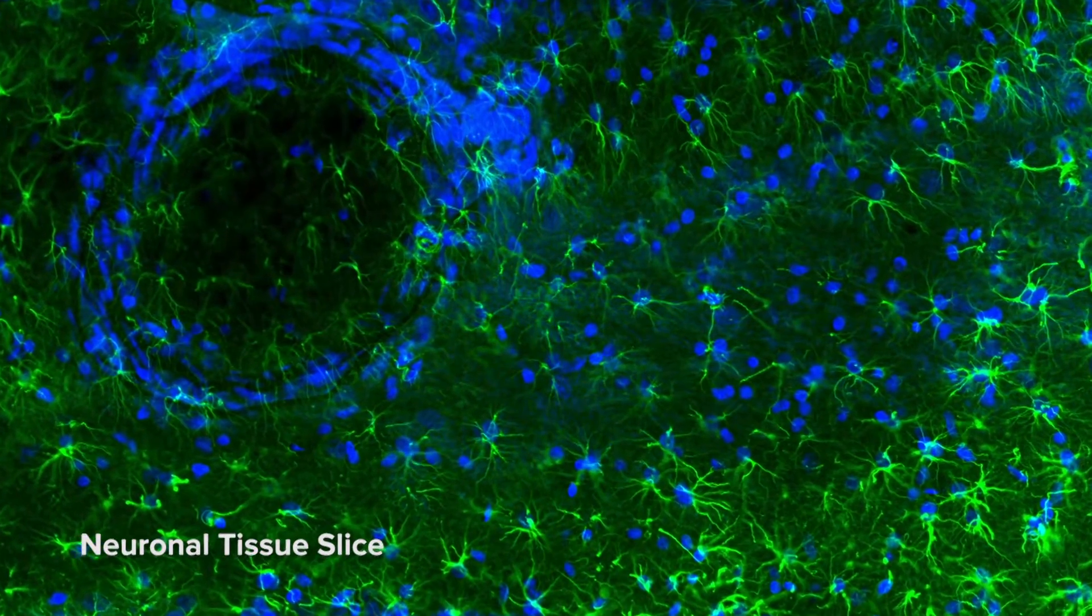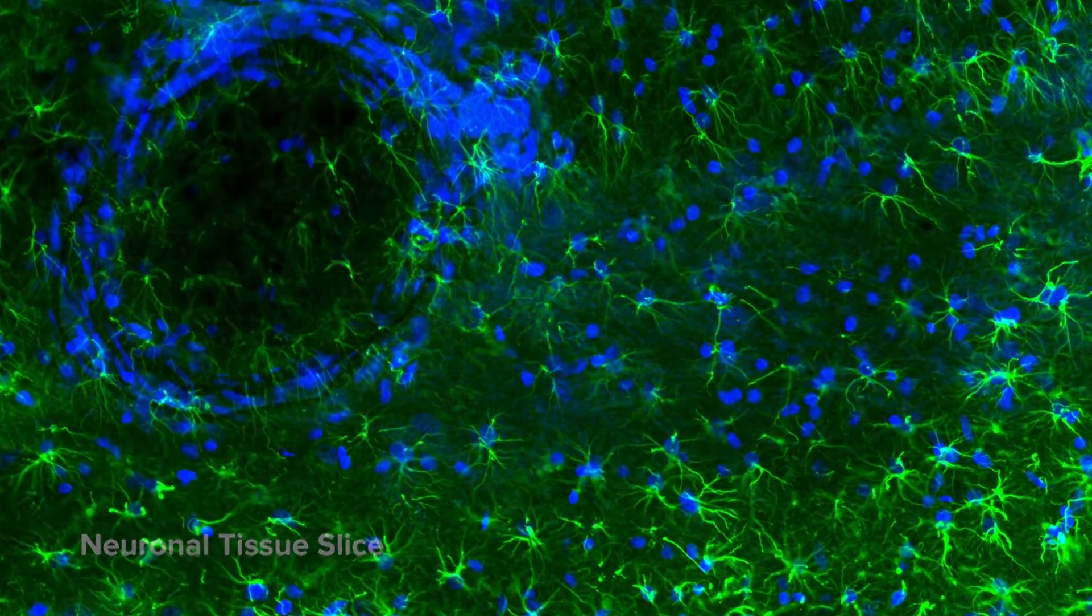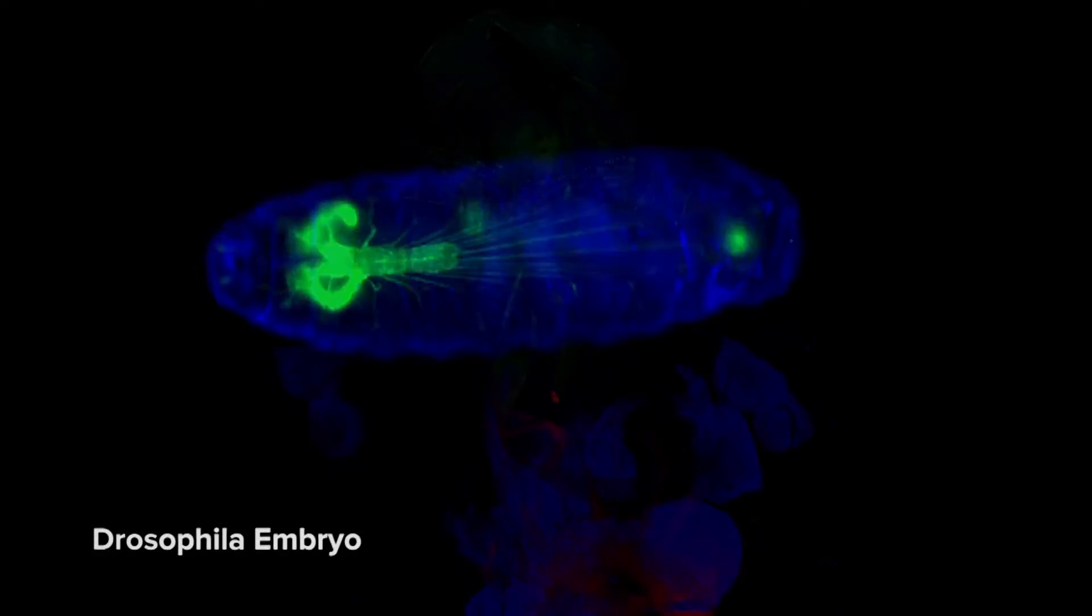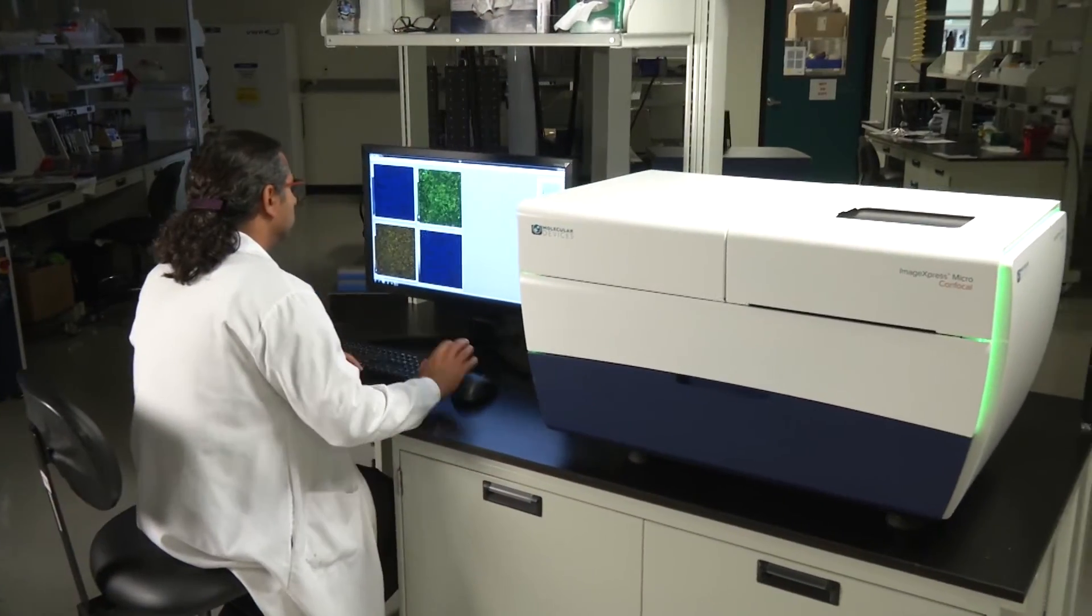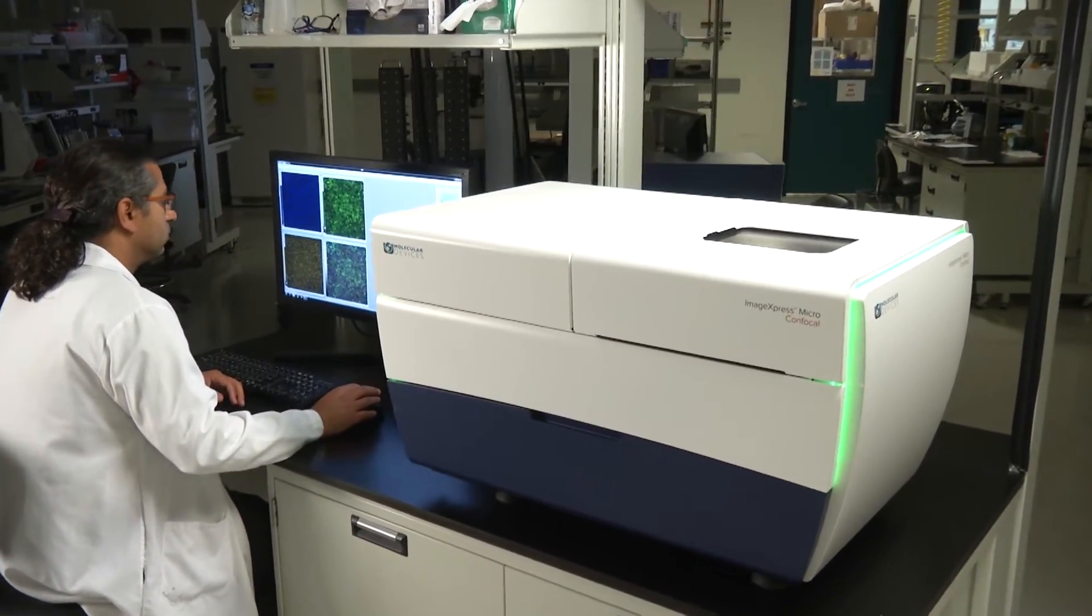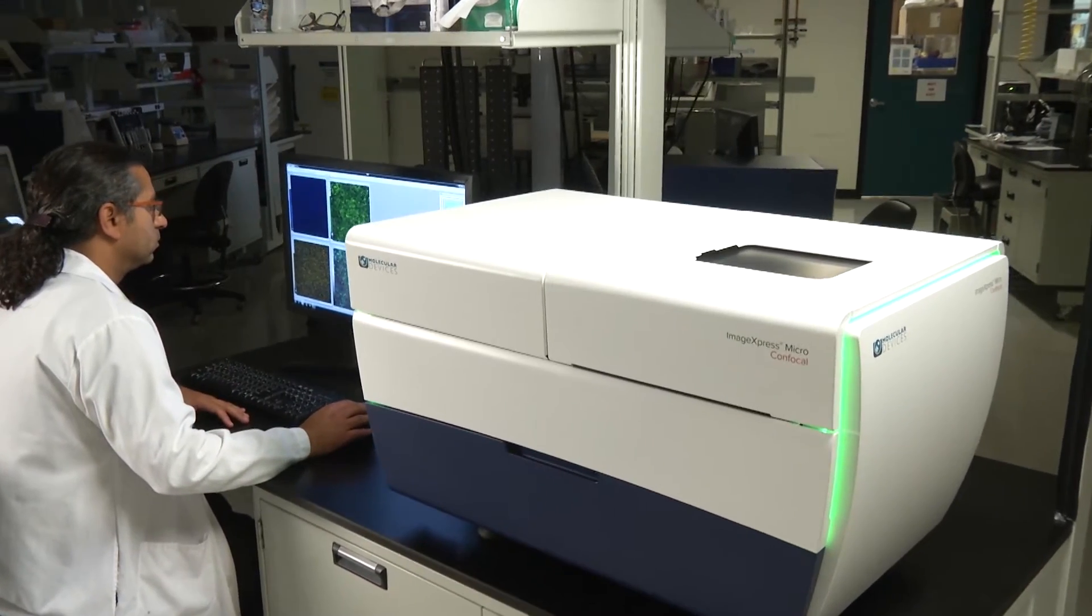Now you can explore new dimensions with the confocal system for your complex biology faster, easier and with better results. Introducing the ImageExpress Micro-Confocal High Content Imaging System from Molecular Devices.